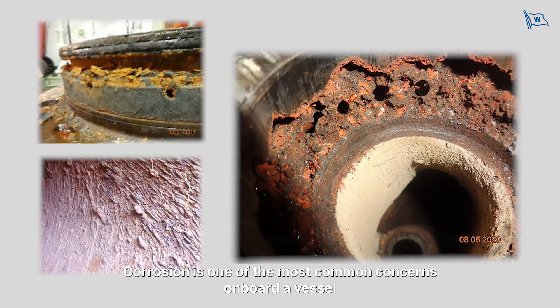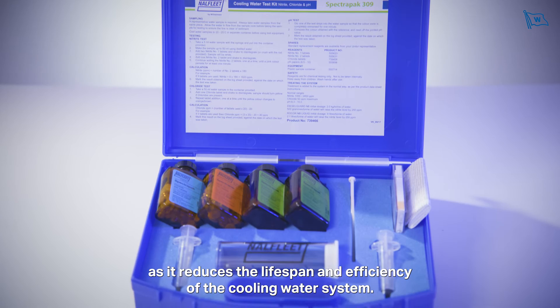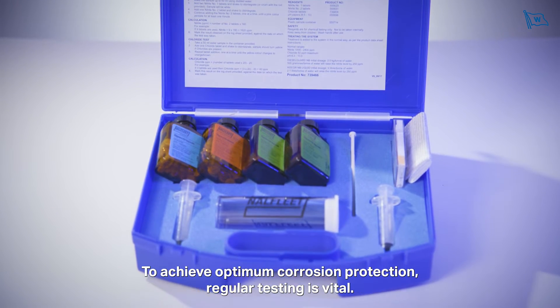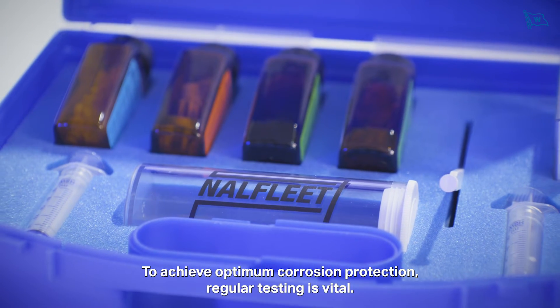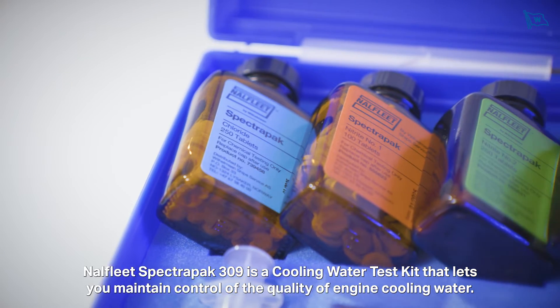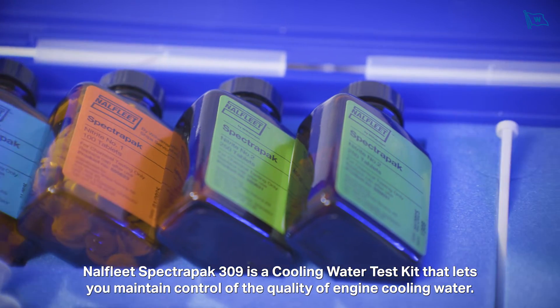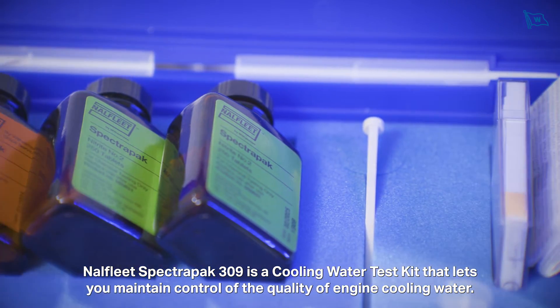Corrosion is one of the most common concerns on board a vessel as it reduces the lifespan and efficiency of the cooling water system. To achieve optimum corrosion protection, regular testing is vital. NALFLEET SpectraPak 309 is a cooling water test kit that lets you maintain control of the quality of engine cooling water.